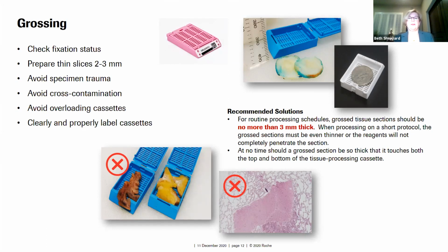Here we see on the bottom two cassettes the specimens are too large within the cassette, and the one next to it, there's actually contamination in a lung sample where a foreign sample was placed in the cassette. You see this many times on a slide, hopefully not many times, but many times.